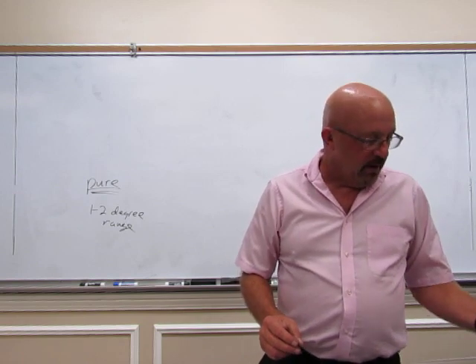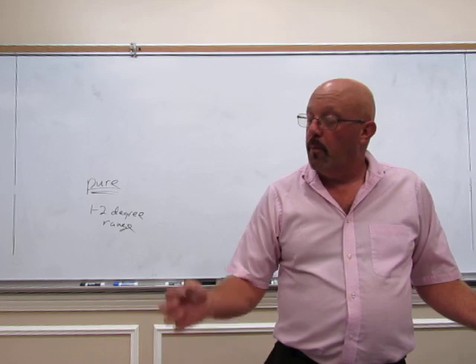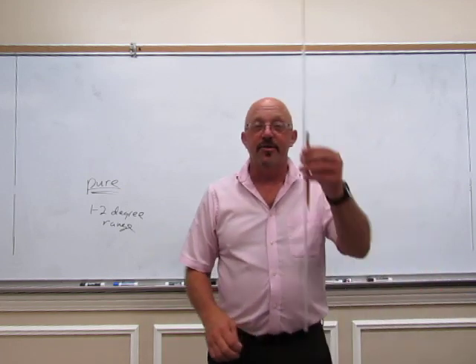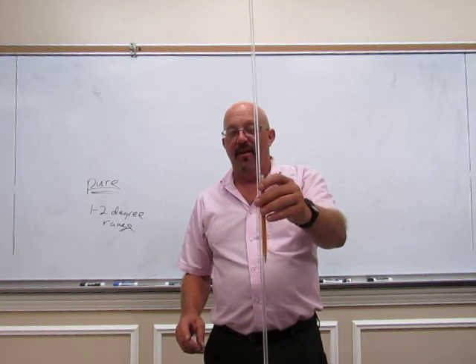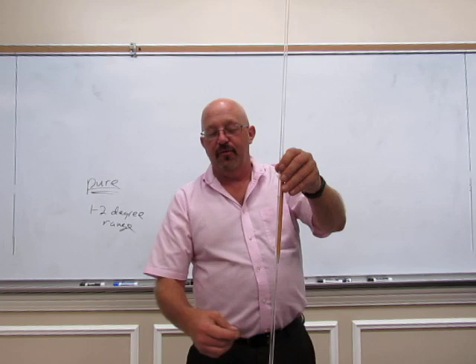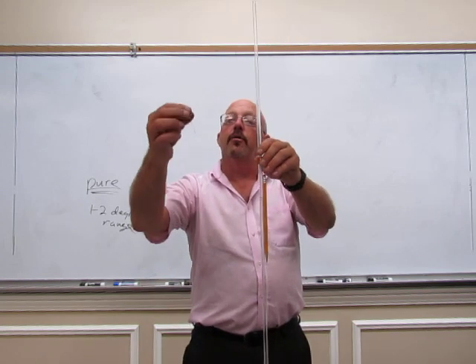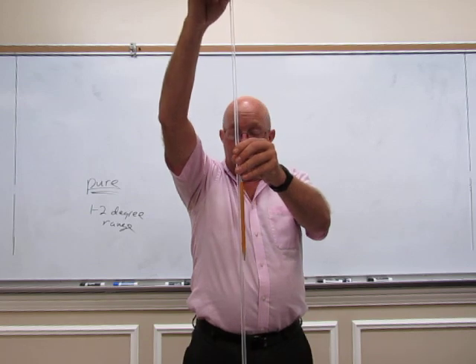We have a very sophisticated piece of equipment that will tap it down for us. We just take a big large tube. I said sophisticated, nothing sophisticated. Just a glass tube. Take the capillary tube, closed end pointing down, and drop it in.